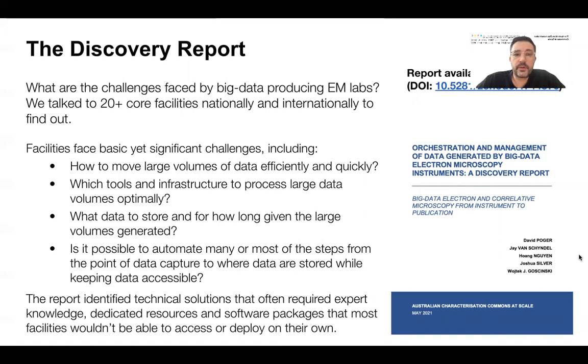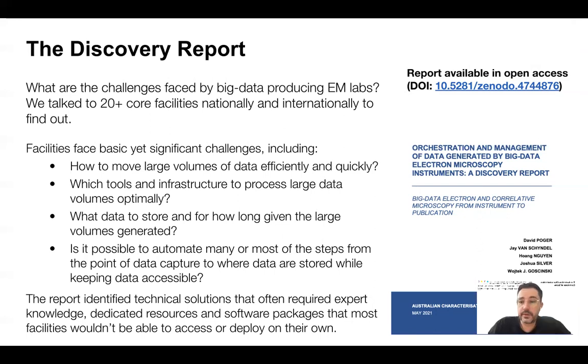So to do this, we've actually talked to quite a number of core facilities across both Australia and the world. And we asked them, what are the challenges with regards to orchestration and management of data generated by big data electron microscopy instruments? So we produced this discovery report. It is available publicly. It's just been published on Zenodo very recently. And I do encourage you to download it and to examine it yourself. It is a very good resource with regards to some of these challenges.